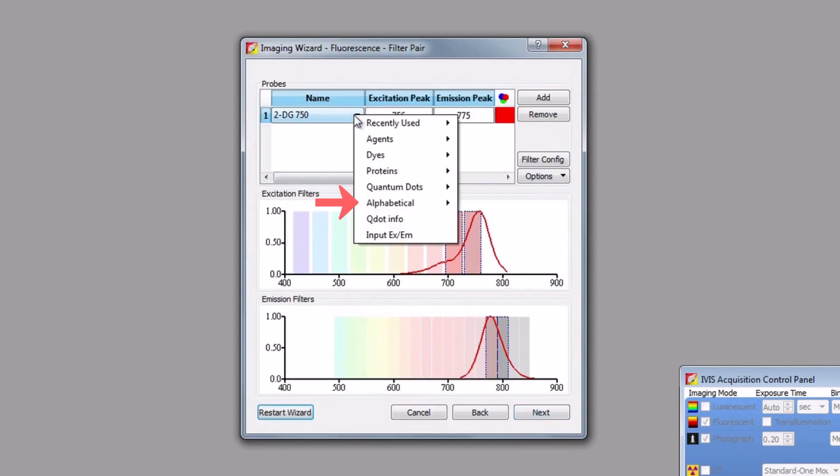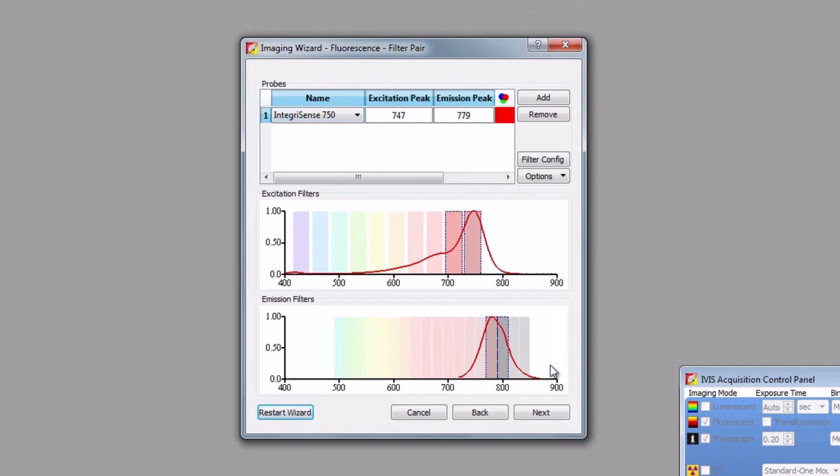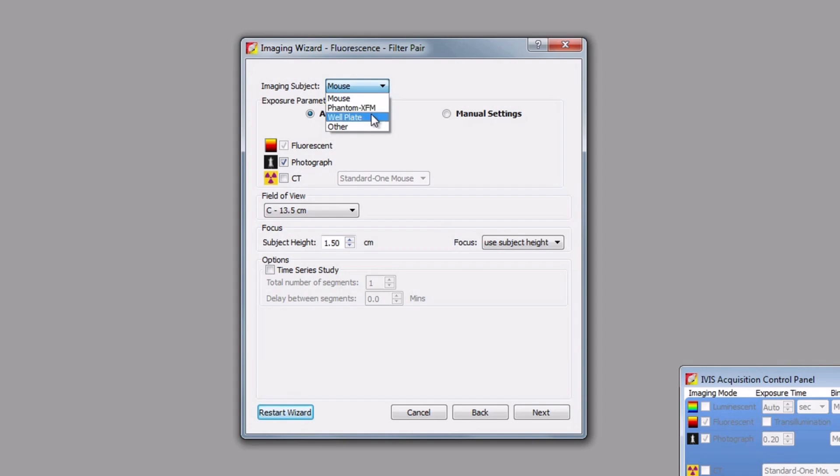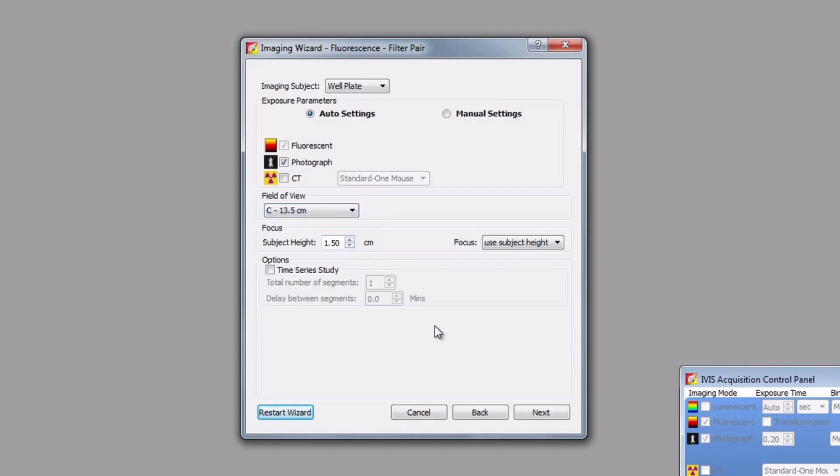Choose your reporter from the list or enter your excitation and emission maxima manually. In our case, we will start with IVISense Integrin Receptor 750. After selection, the relevant excitation and emission filters are chosen automatically. The final screen requests details about acquisition parameters and experimental design such as subject type, auto or manual exposure, and field of view. Select well plate from the imaging subject drop-down menu. We recommend auto-acquisition settings, and choose the appropriate field of view, usually C or D, depending on the number of plates to be imaged, and then click Next.